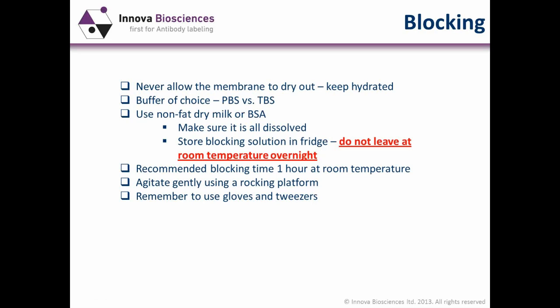I found that I could take TBS and, with a Western blot and a new antibody that I've never tried, create an optimal blot within about three rounds of optimization. So, for me, TBS, or Tris buffered saline, became the buffer of choice.